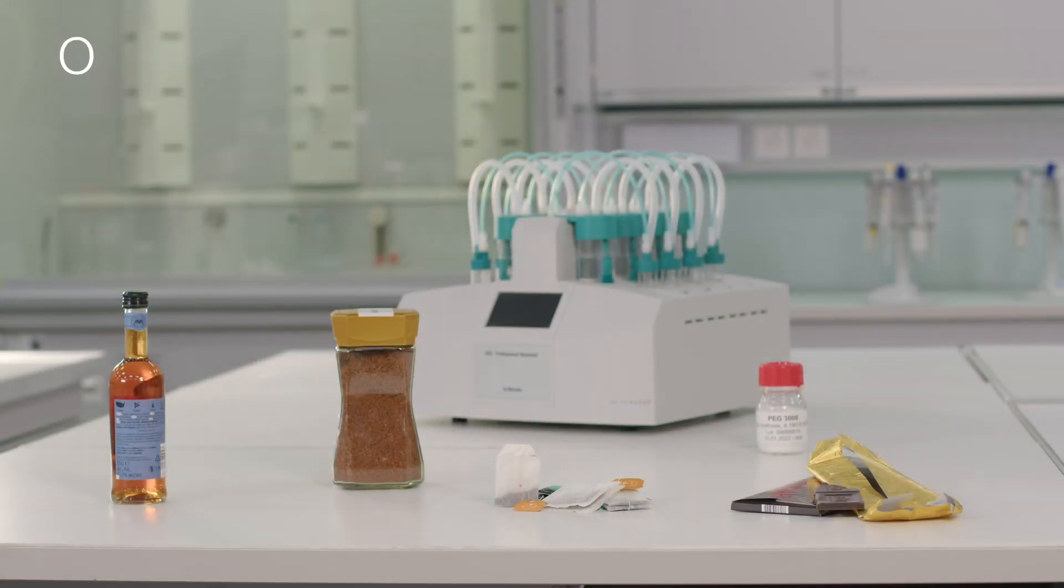For such samples, which have a low fat or high water content, we can use PEG as an indicator and carrier material.